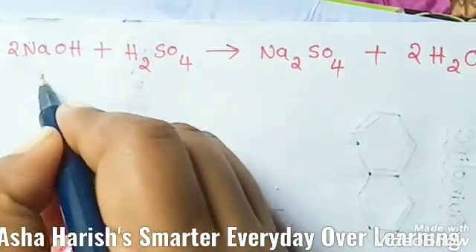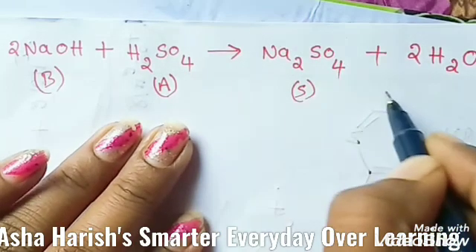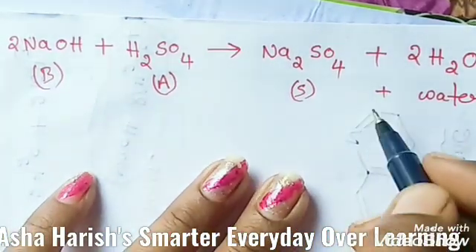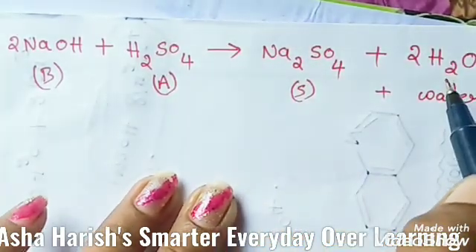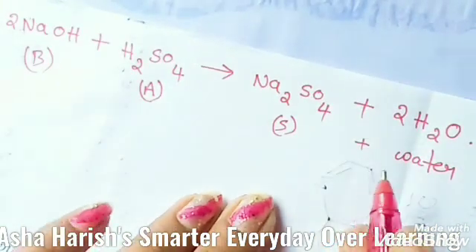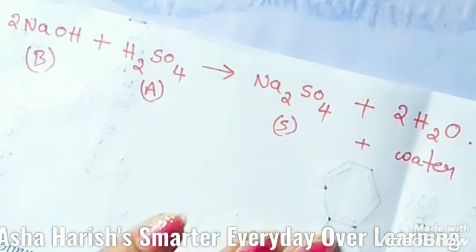NaOH is the base here and H2SO4 is an acid, and when a base reacts with an acid, obviously salt and water will form. This is according to the neutralization reaction, also called an acid-base reaction. According to that only, here you can see the formation of sodium sulfate salt along with water. This is the final equation after completion of the titration against the standard alkali solution. From this, the volume of the acid used up, or the volume of the ammonia which is evolved, and hence the percentage of nitrogen in the organic compound can be calculated.